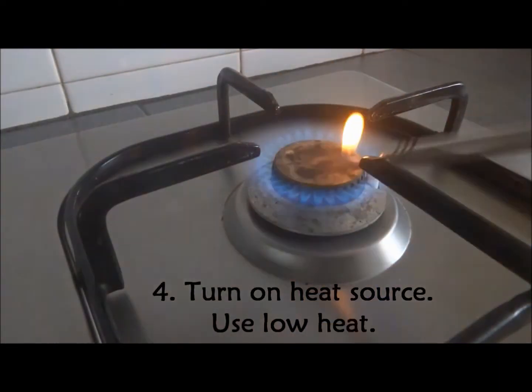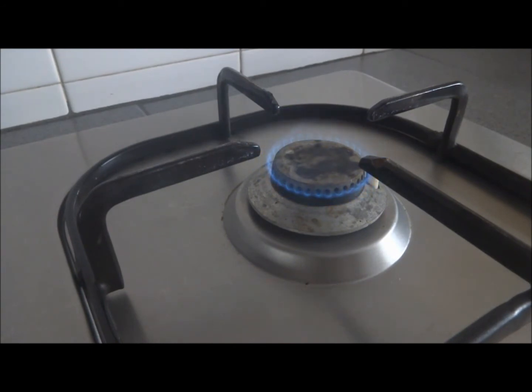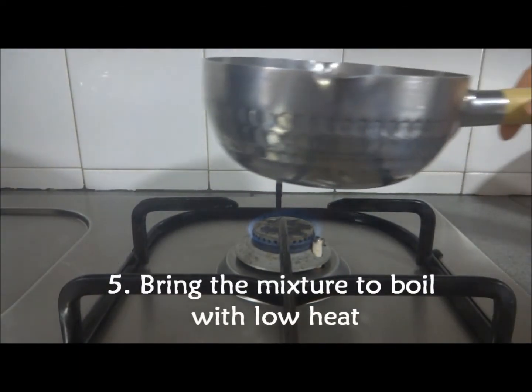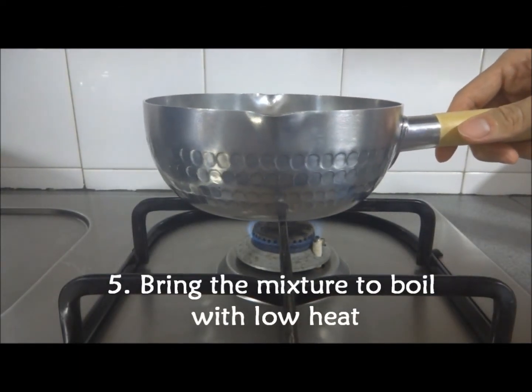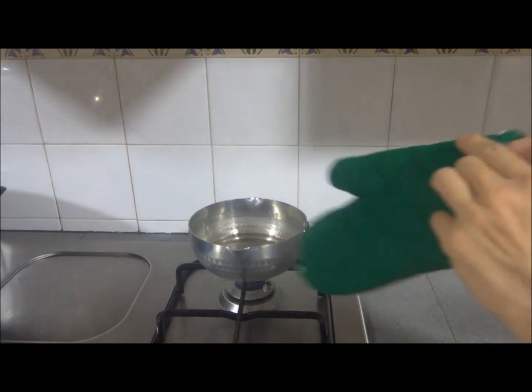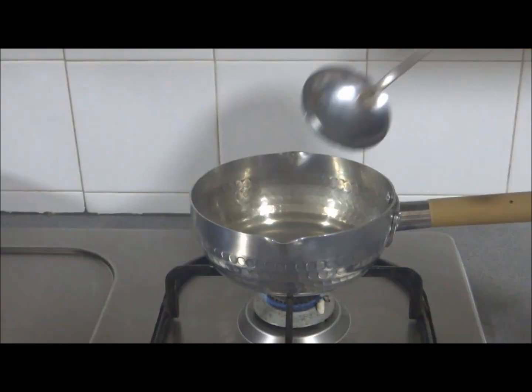Next, turn on the heat source and switch to low heat. Bring the agar mixture to boil over low heat. You should put on oven gloves or any heat-resistant hand protection and constantly stir the mixture.